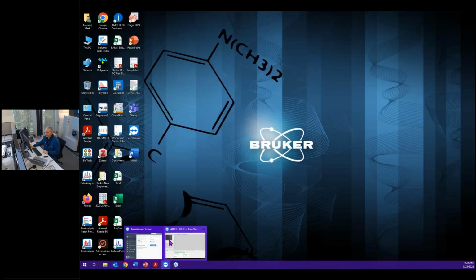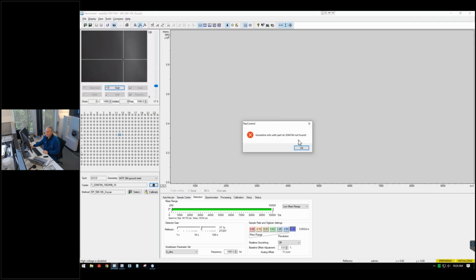And what's happening right now while I'm speaking is that to transition from atmospheric pressure to high vacuum, we have to go into a lock. So the lock is going to be at atmosphere, it's going to then put in the target. The lock is going to pump down, and then from the lock, the target will be inserted into the source.